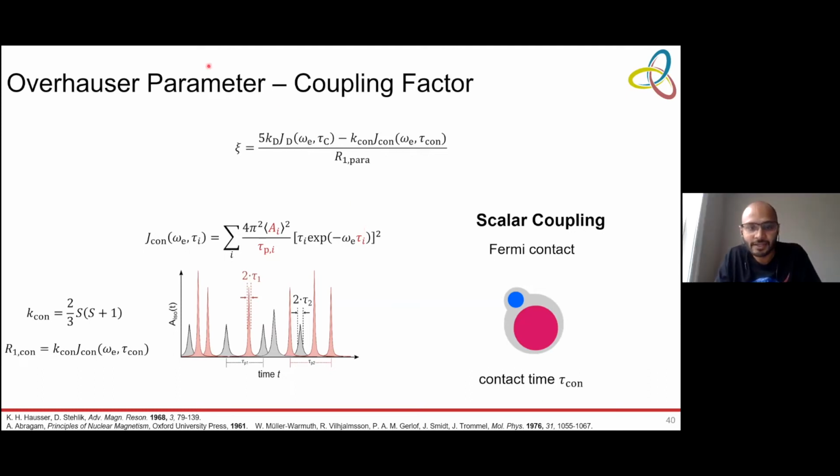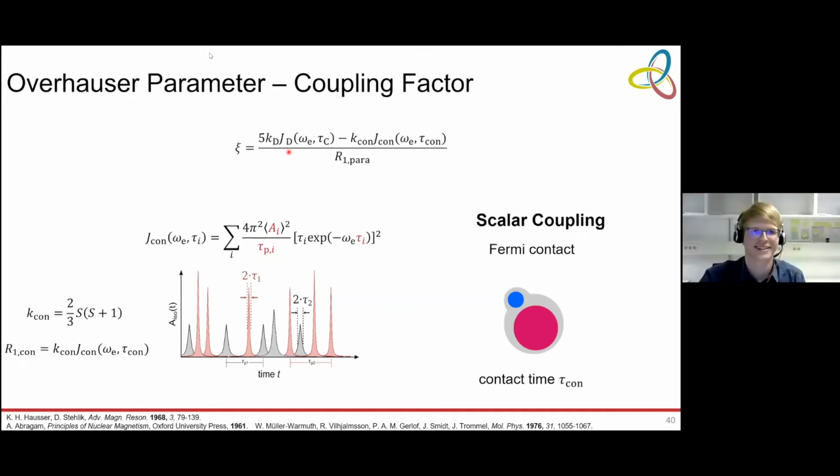There is one question. Can you comment on the overall range of solution conditions that are accessible at high magnetic fields? And in general, what is the microwave heating effect for polar solvents? It is large. So you heat your sample.